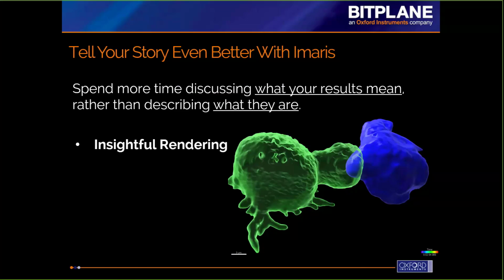And so you see that highlighted here in this image where we have a T cell interacting with a cancer cell, but also because of some additional information that we're able to include in the surface rendering, which I'll go over in just a second. So the first part of my talk will be about this insightful rendering.